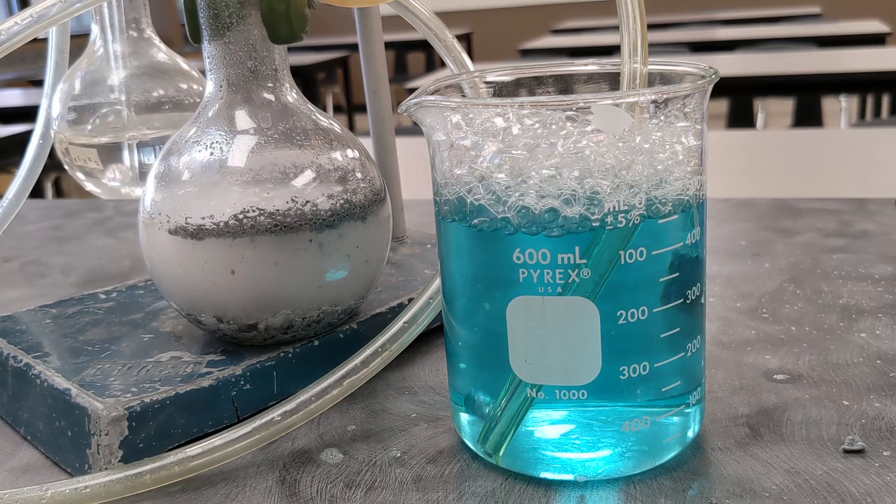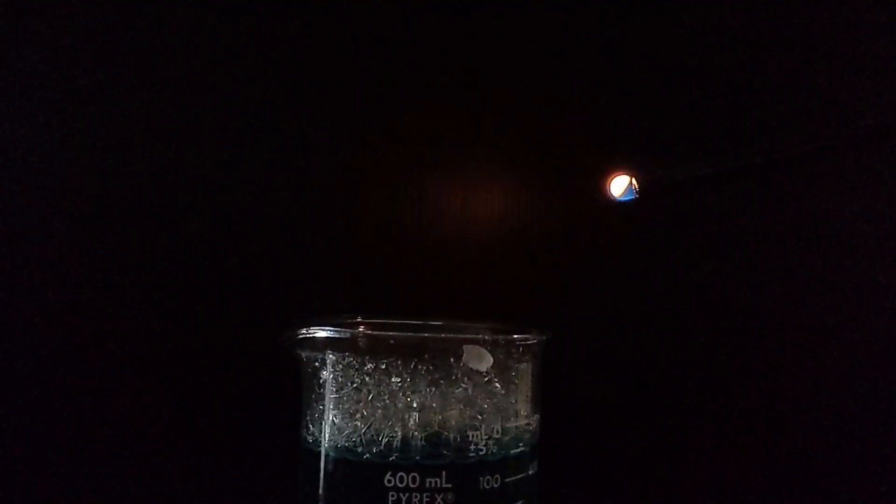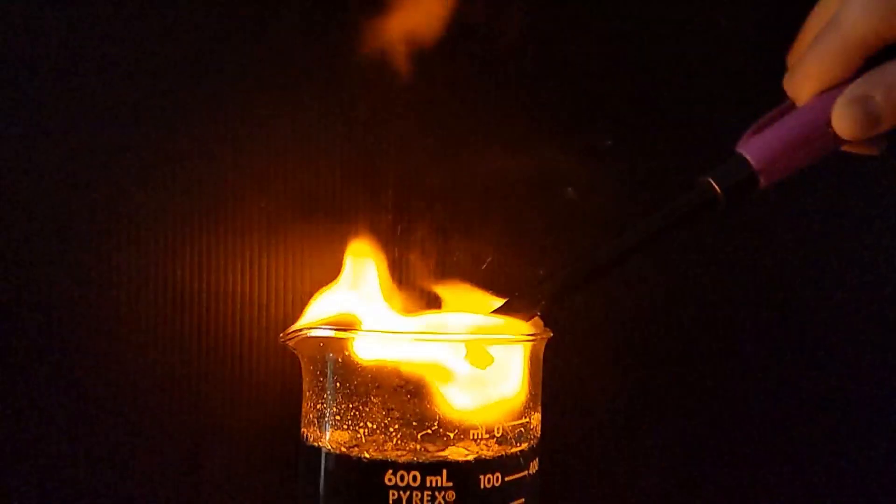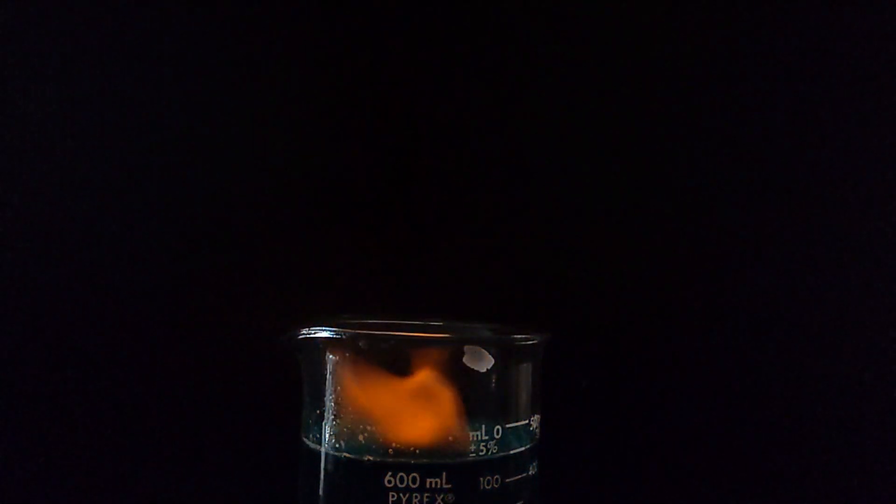Cleanup is critical when it comes to an experiment like this. We don't want to leave these bubbles laying around, so we need to make sure to dispose of them. Of course, we get to choose how to do that. Until next time!